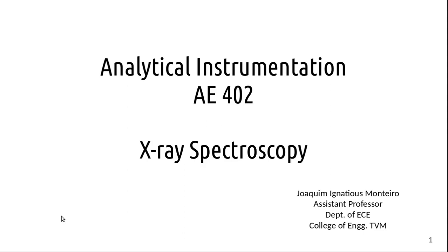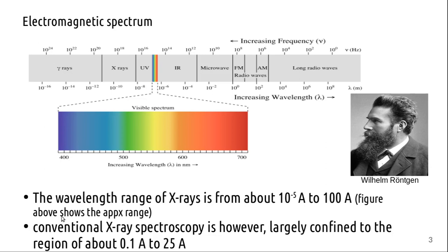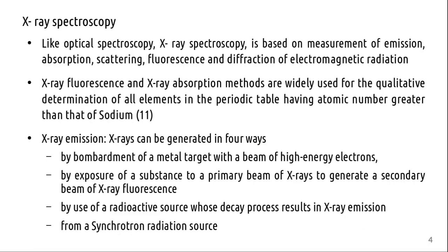Hello, today we will discuss X-ray spectroscopy. We are all aware of the medical applications of X-rays. We will now discuss the use of X-rays in analytical chemistry. X-rays can be used as a very valuable tool in analytical instrumentation.